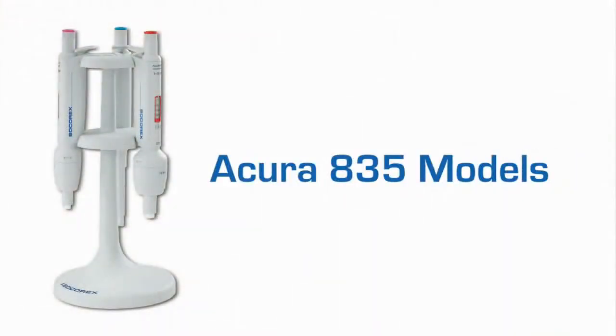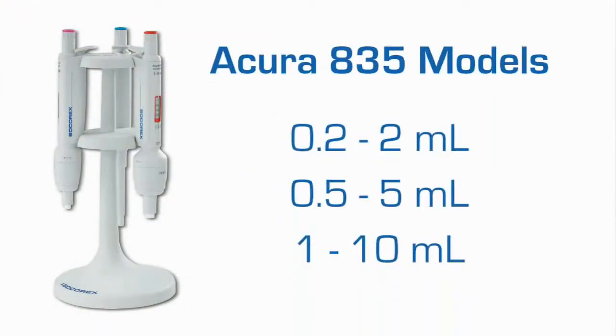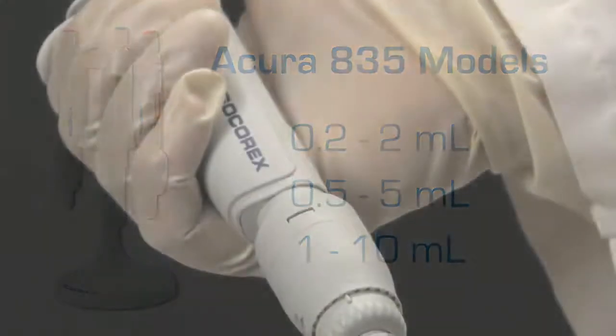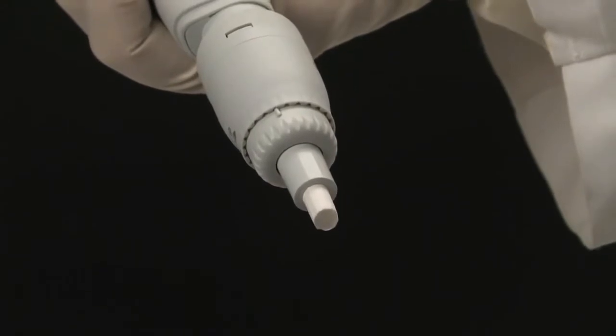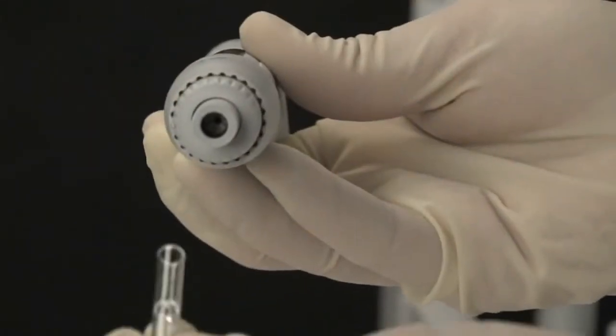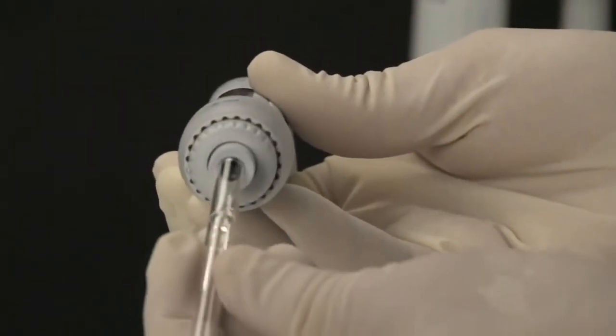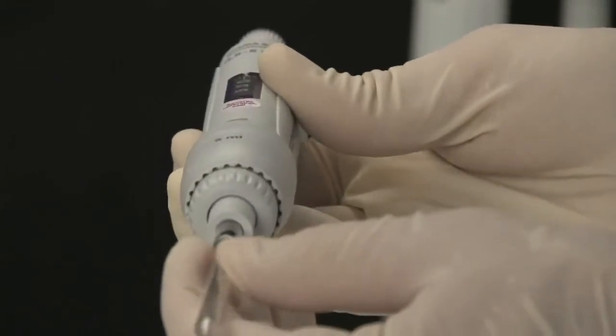The Acura Manual 835, which is offered in three sizes for larger samples, can accommodate nozzle filters for added protection against liquid fill and contamination. An optional adapter nozzle allows for the use of pasteur pipettes on the 2 and 5 milliliter models.